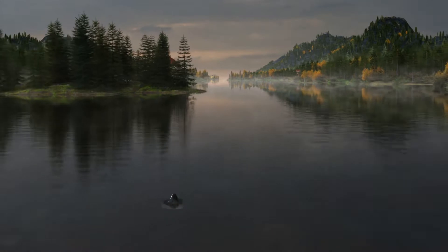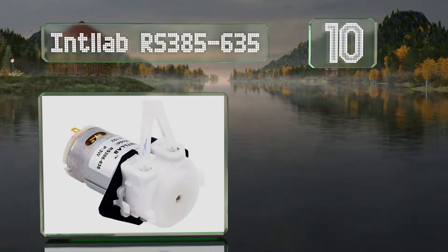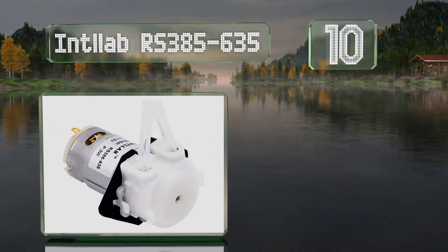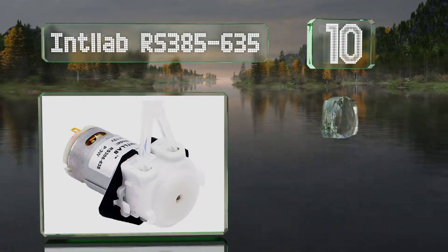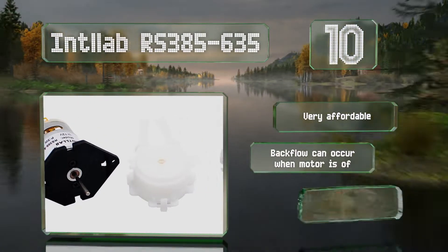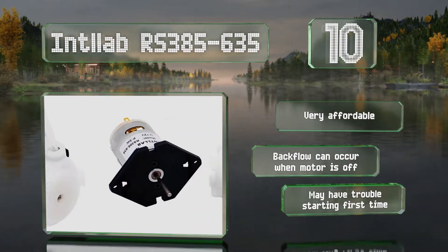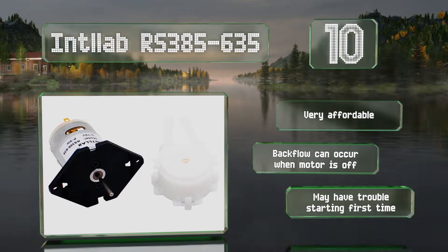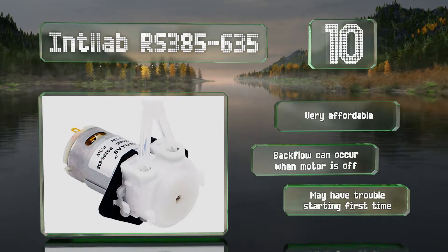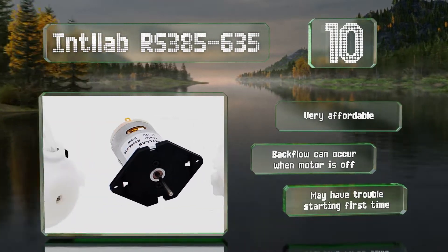Starting off our list at number 10, with a transfer rate of up to 1.6 gallons per hour, the Intel Lab RS385-635 is a good choice for small biochemical, pharmaceutical, and general laboratory projects, as well as for miniature tanks and aquariums. It runs on a 12-volt DC motor and draws very little current. It's very affordable too, however backflow can occur when the motor is off and you may have trouble starting it the first time.